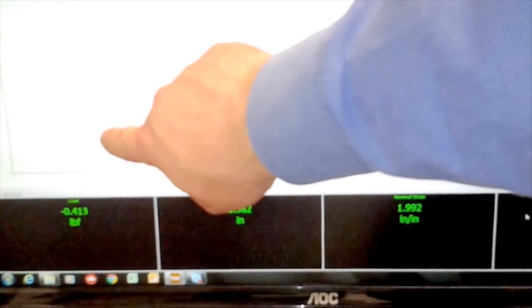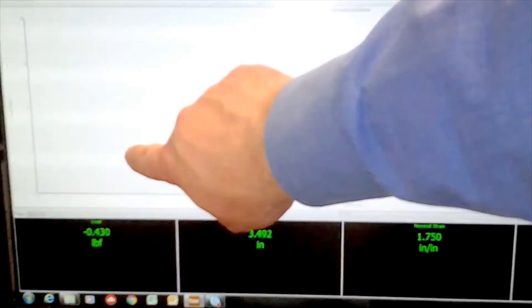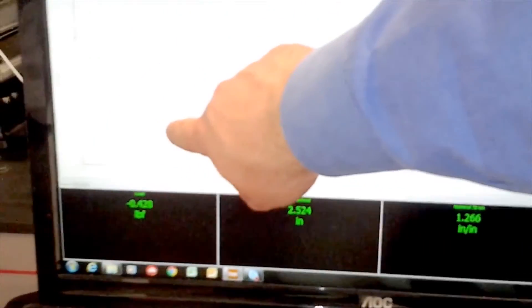The pounds for the yield point — this is the pounds for the yield point. And then as the material is subjected to stress, the strain increases until we reach our break point, and then it fails. So we have our stress curve versus our strain.